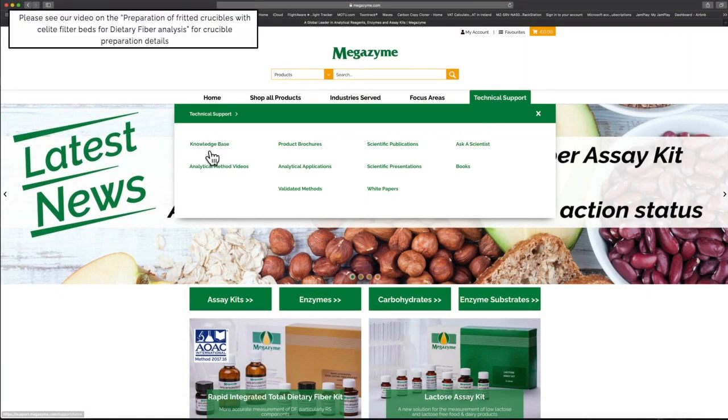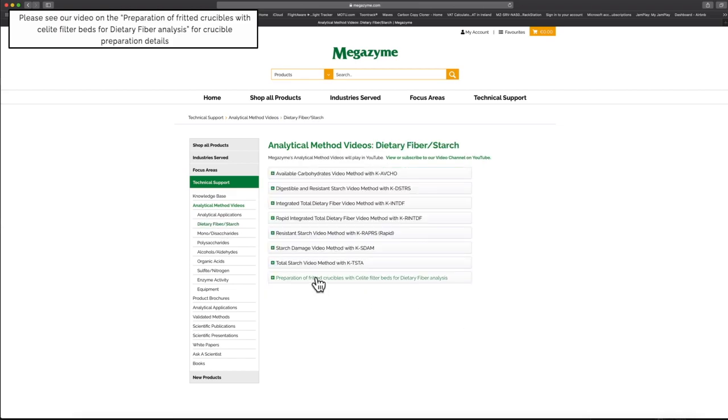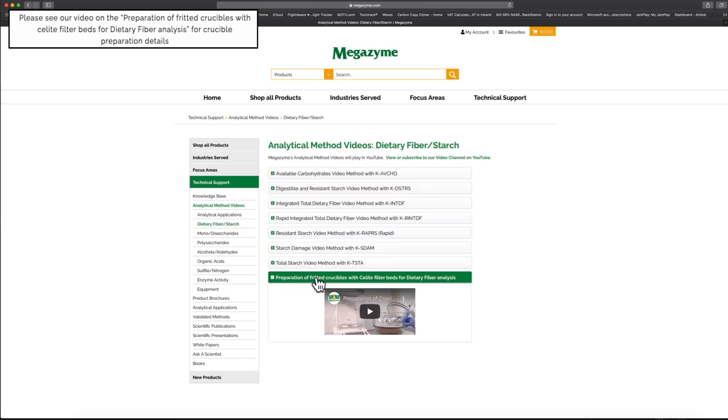Please see our video on the preparation of fritted crucibles with Celite filter beds for dietary fibre analysis for further details on how to prepare crucibles for dietary fibre sample analysis.